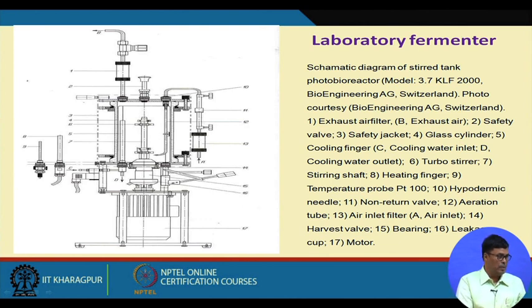And this is the agitator shaft. This shaft is a little bit different from the normal rod that we have. It should be perfectly straight because it passes through a mechanical seal, and the mechanical seal is a very important thing in the fermentation industry, because one is the moving part and the other is the stationary part.